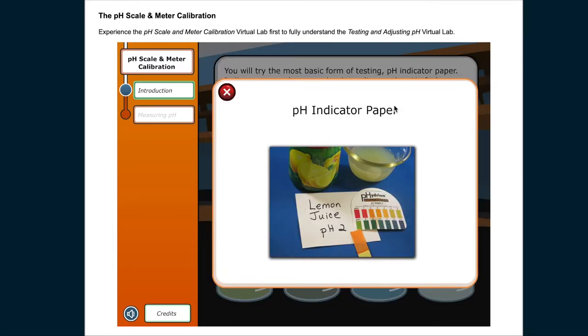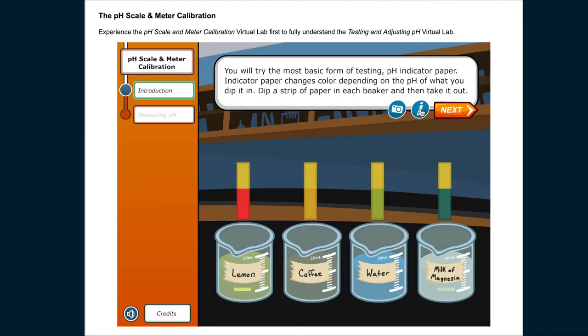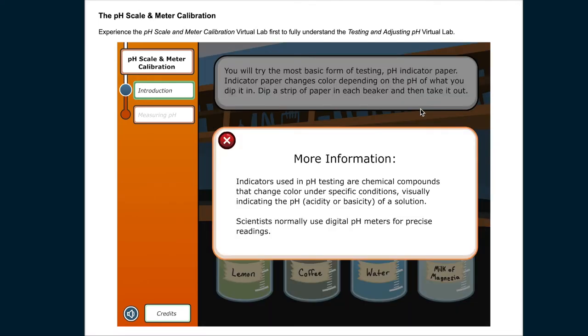pH indicator paper. Indicators used in pH testing are chemical compounds that change color under specific conditions, visually indicating the pH, acidity, or basicity of a solution.